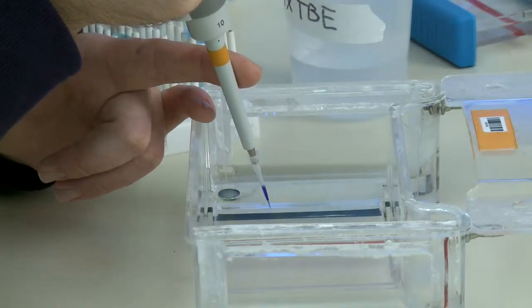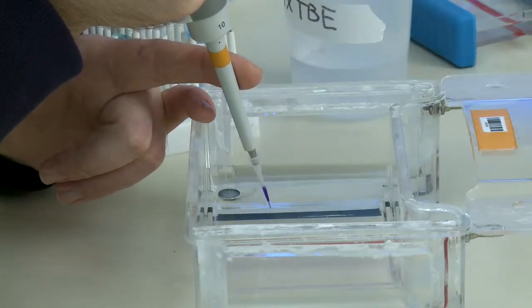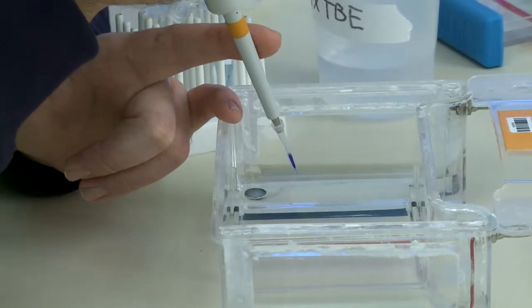When we dispense our sample, when we actually put our sample into the gel, we have to make sure that we're not going too quickly with this. We don't want to blast the sample into the well and then up out of the well and into the buffer. It'll float away and you'll never see it again. So we want to go slow with this.